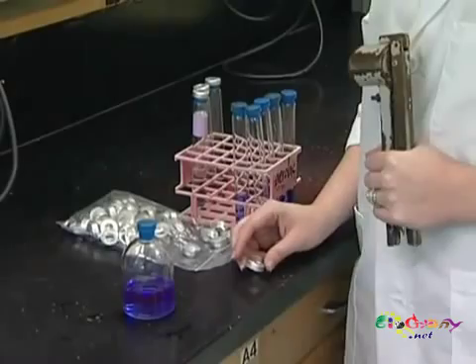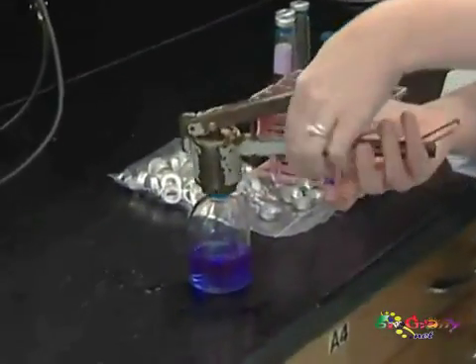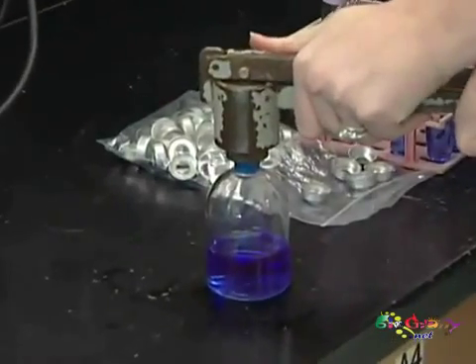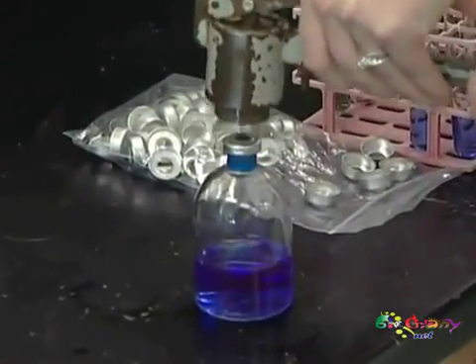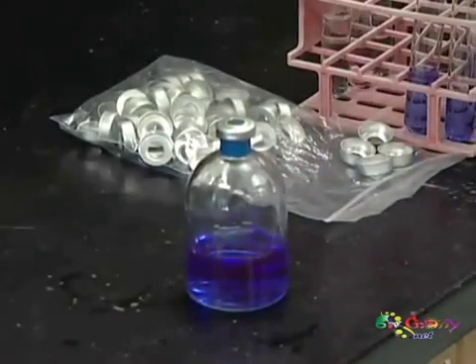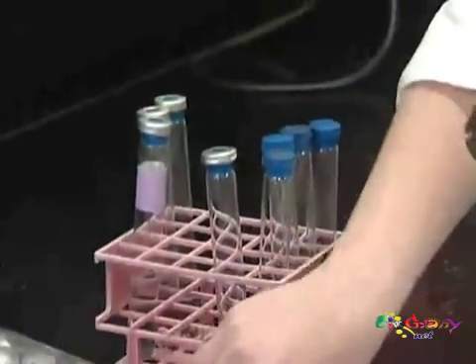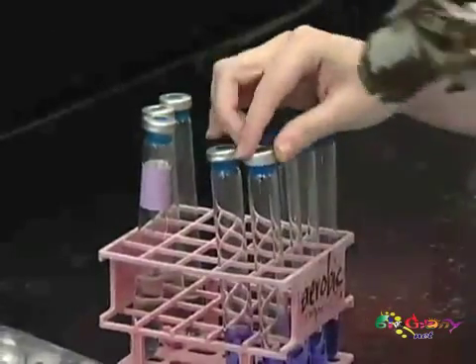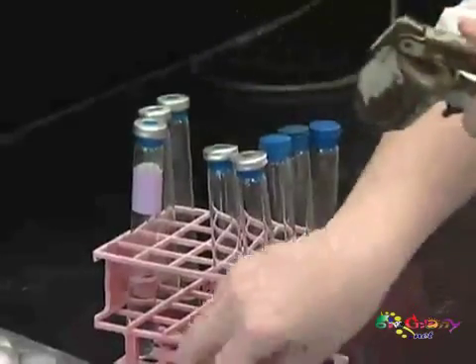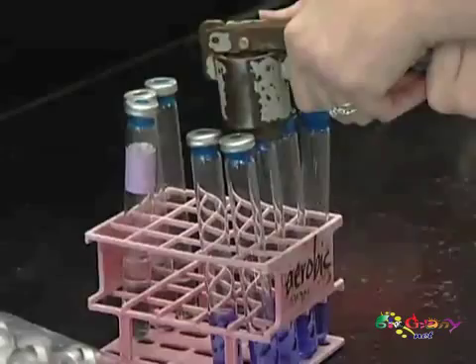Now that you've got your media dispensed, we'll want to seal it with aluminum seals. We do this for two reasons: so that the stopper doesn't pop out while you're autoclaving, and secondly because some of these cultures will later on be under pressure and your stopper will pop out again. You want to make sure you get a good even seal and that it is actually crimped all the way down.